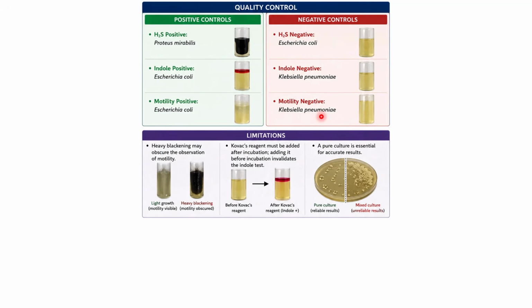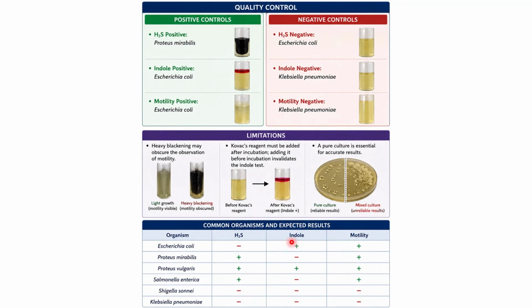Limitations or some important tips to know. 1. Heavy blackening may obscure the observation of motility as shown in the pictures here. And also, Kovac's reagent must be added after incubation, because adding it before incubation invalidates the indole test. And a pure culture is essential for accurate results. Some common organisms and their expected results in the SIM test. So I'll leave this part for you to go through.